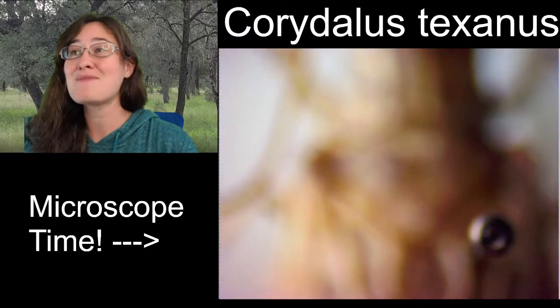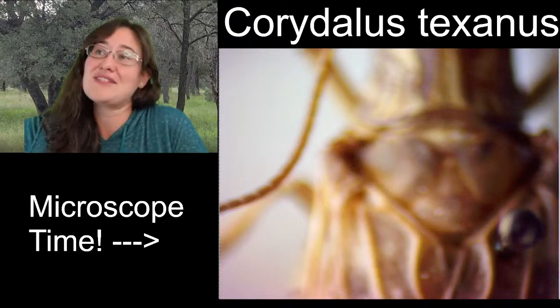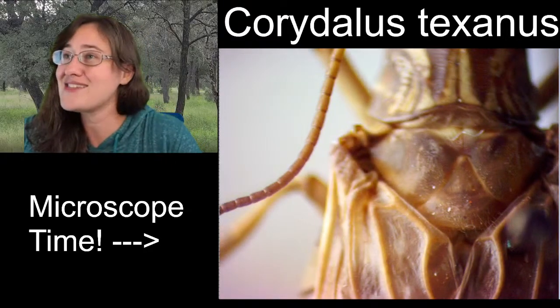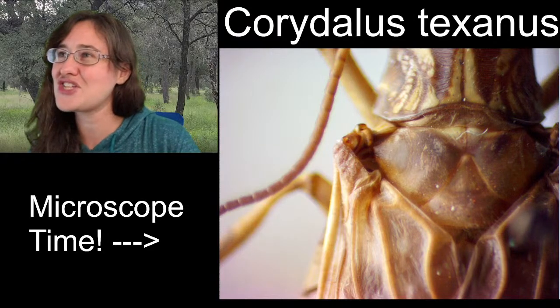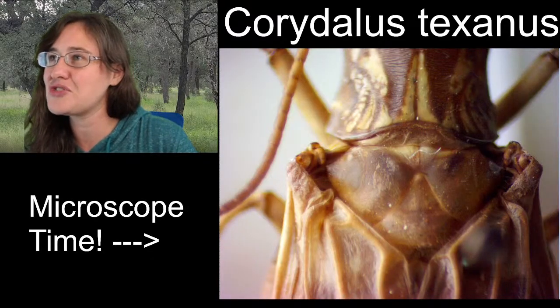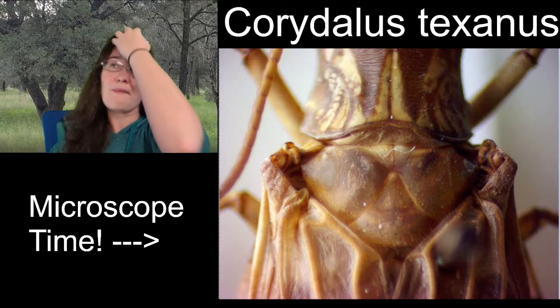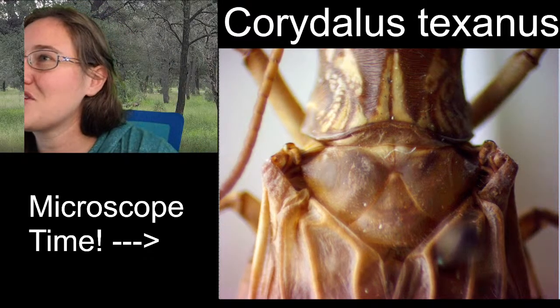I'll admit I'm not super comfortable sketching Dobsonflies. I haven't sketched very many of them in the past, and so when I'm first sketching a lot of these guys, I really like to take a closer look at some of the micro stuff in here. Let's check that out.